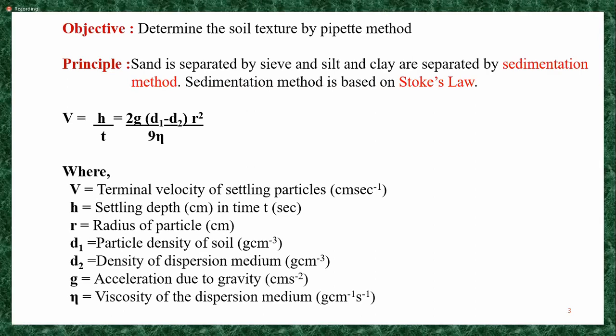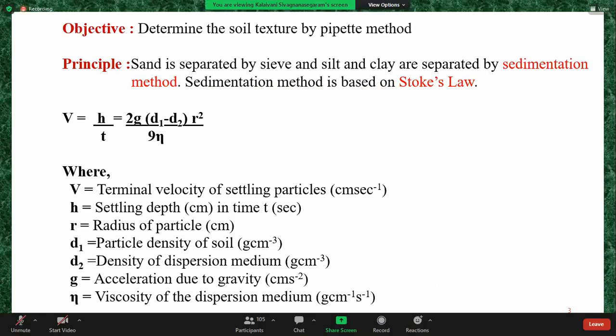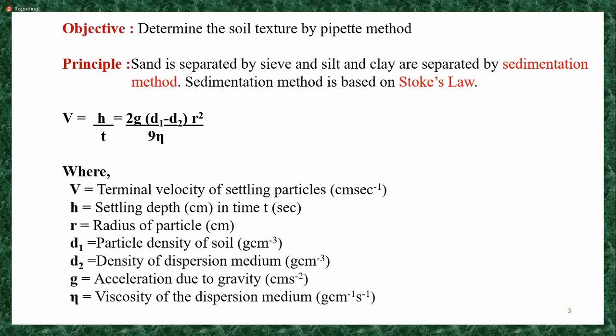You all know what is velocity, right? Here the velocity is equal to h by t, that is the traveling depth over time.